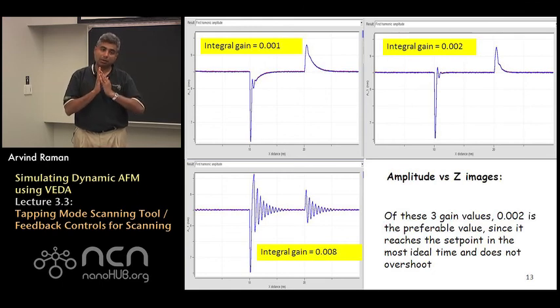It takes a little while, a little longer for the amplitude to reach its steady state. So you want to see that the set point value.